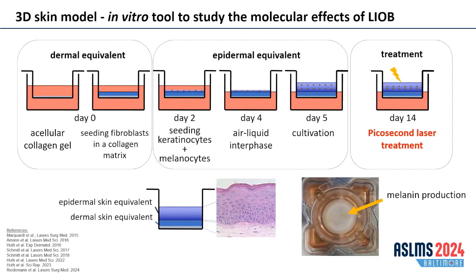As you can see here from selected references, our lab has extensive expertise in the development of standardized 3D skin models to study the molecular effects of lasers. Such in vitro models are a pretty good alternative to in vivo experiments.